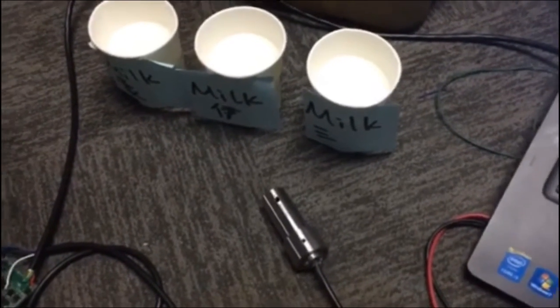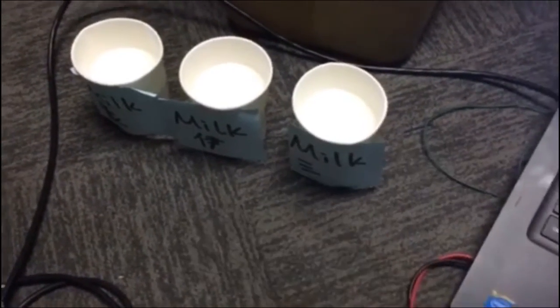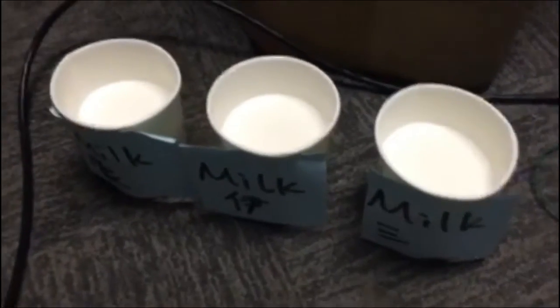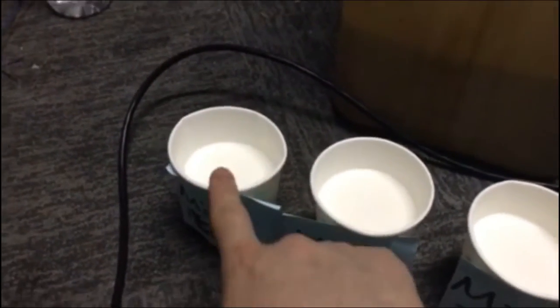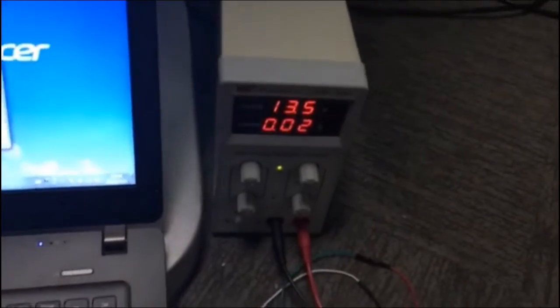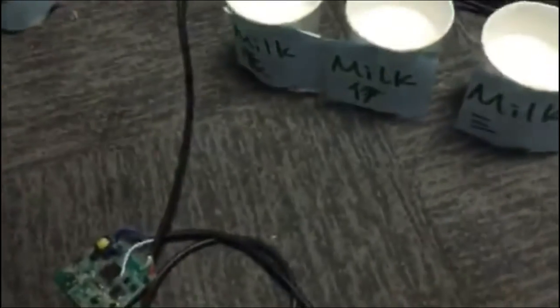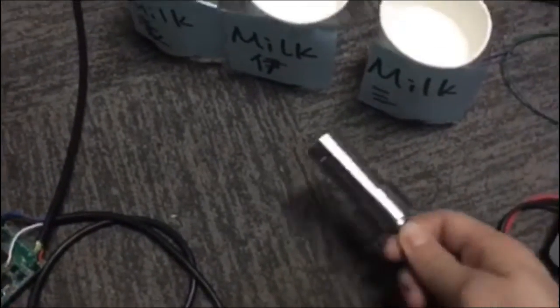Hello, this video is to introduce and test the DM500 density sensor. We test it in different milk: milk 1, milk 2, and milk 3. We have a 13.5 volts power supply and a USB connector, and also we have the serial port monitor to read the data. First, we put the sensor in this milk.